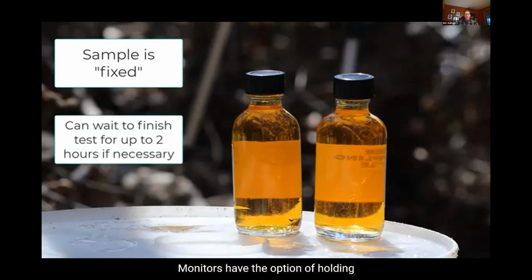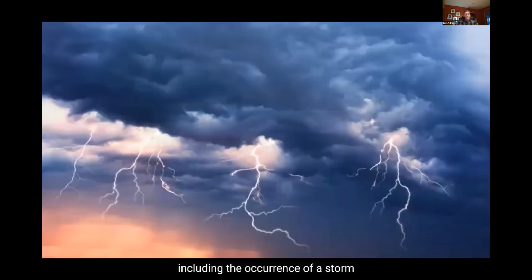Monitors have the option of holding or transporting fixed samples for up to 2 hours before further analysis. This is rarely necessary, but may be useful in some cases, including the occurrence of a storm that might prevent a monitor from completing the test stream side.